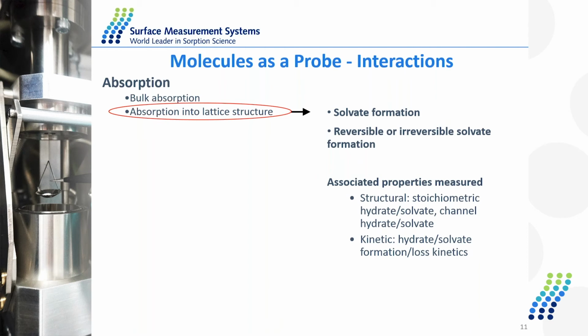So in the case of stability or shelf life studies for food samples, we will use water as the probe molecule to measure the different interactions between water and the food material by different types of sorption-desorption isotherms from a set of DVS experiments.